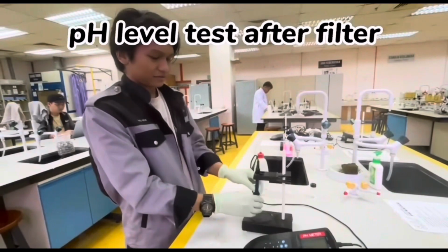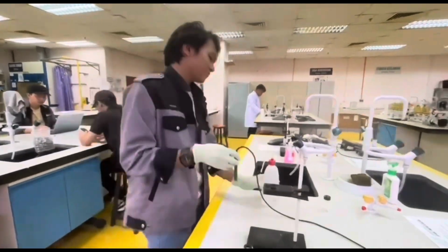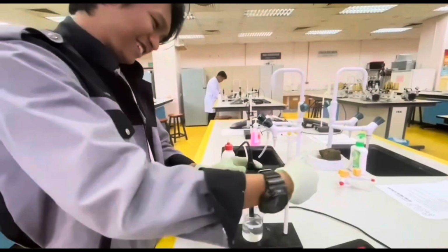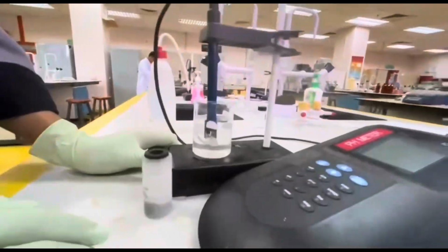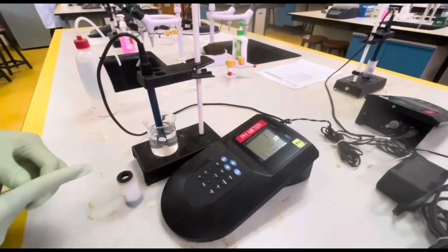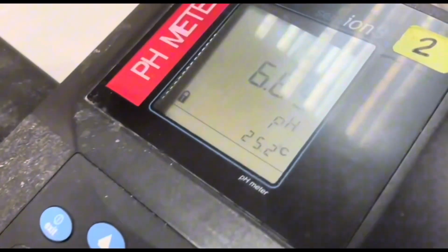For the pH test after filter, first we need to remove the cap of the pH meter, and then we rinse it with the distilled water. After that, we put the pH meter into the water sample. For the precaution step, make sure the pH meter does not reach the bottom of the beaker of the water sample, and then we switch on and take the reading. So the reading is 6.69.